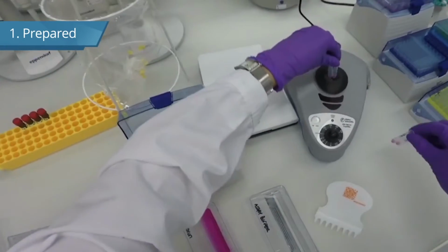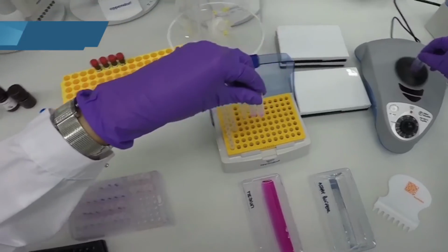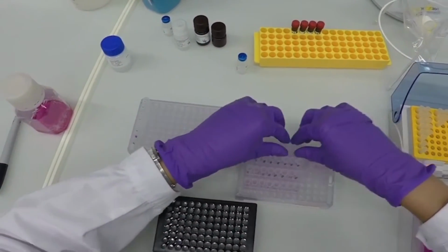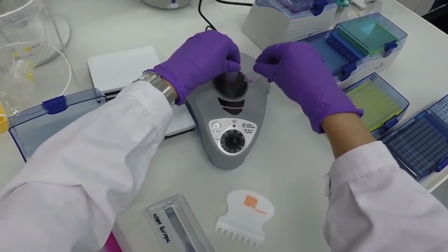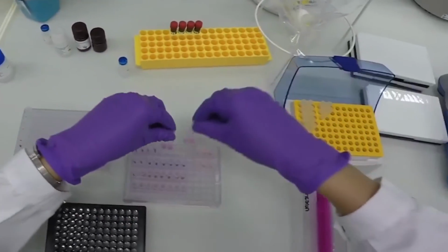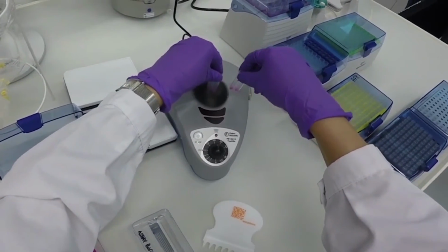In this video, you'll see one of our scientists carrying out an experiment to identify and measure inflammatory proteins in cells that were exposed. The cells were liquefied to produce a cell lysate, which is then analysed. This allows us to measure all the proteins that were inside the cell.